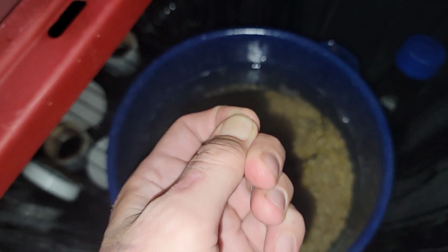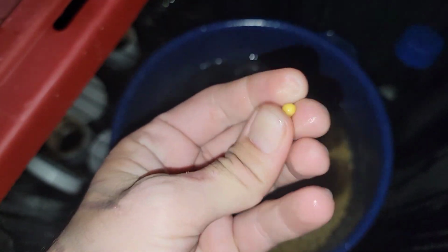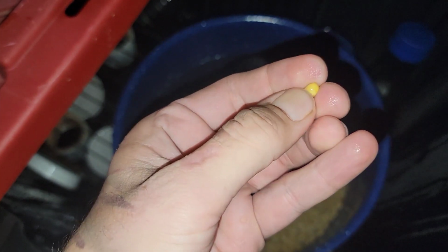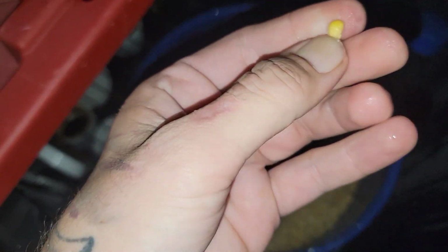So let's go check our grain. Got a little sample right here. Grab it. Oh, yeah. That's perfect. That meshed perfectly in my finger. And then I'm pretty sure if I take it and just pinch it right here, we'll be able to cut the top off and we won't really see too much white in there. Slipping everything. Oh, there we go. Split perfectly.